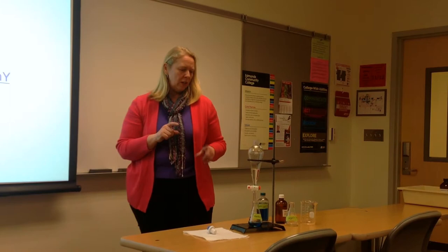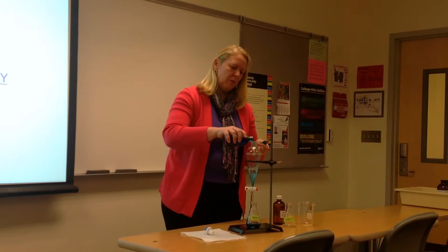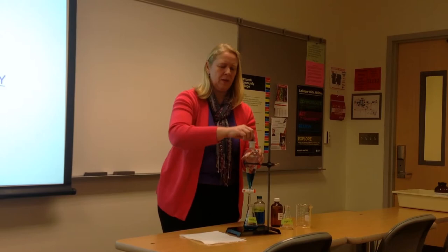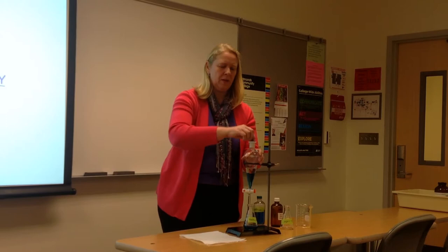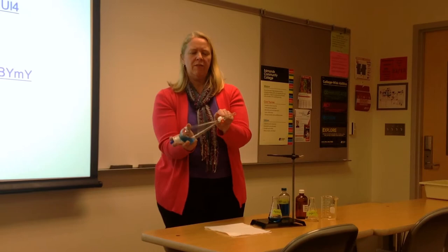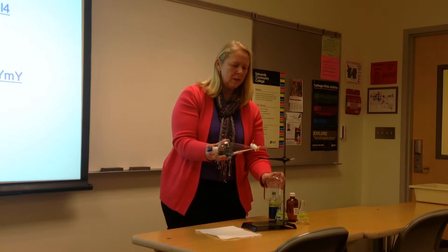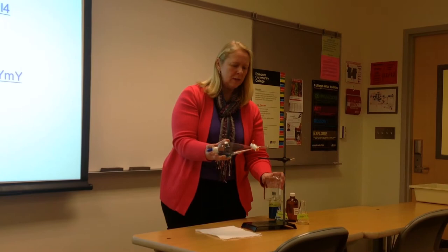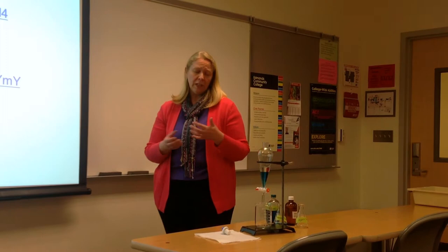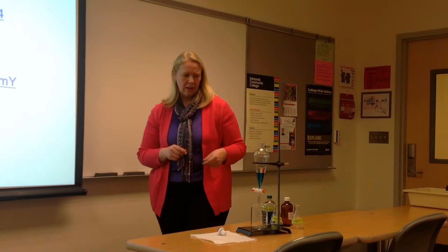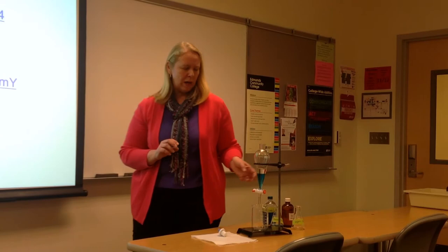This would be our second extraction — adding some more sodium hydroxide. Put the stopper on and vent. One thing you want to avoid is shaking really heavily because that could lead to emulsion. An emulsion is a colloidal mixture of the two solvents that won't break up very easily. The second video shows nicely how you can get an emulsion and various tricks to deal with it. A lot of times, just rocking gently and waiting is all you need.